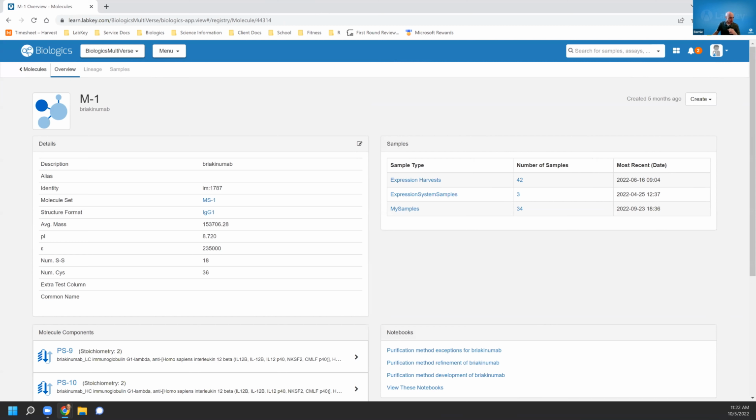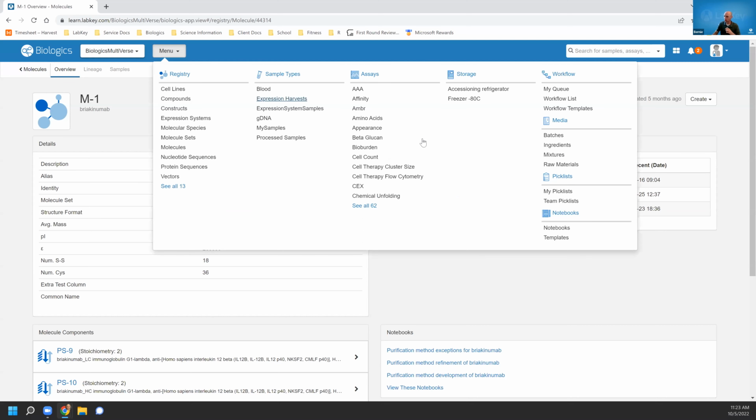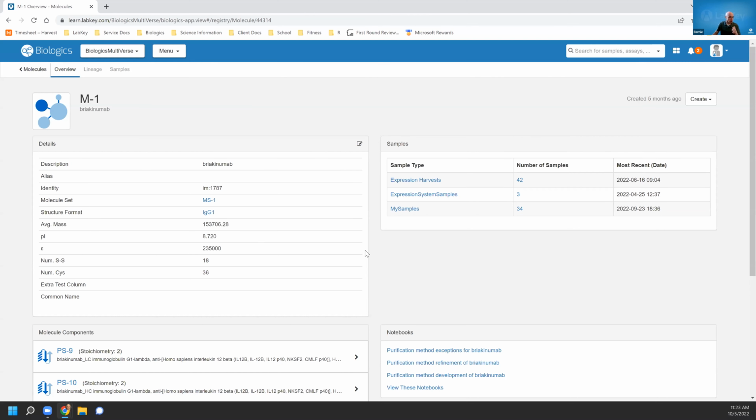So then there is ELN. So as a most often daily, but at least weekly operation, you are not going to be able to dodge doing your documentation. But especially with respect to time, you are going to be able to dodge me dragging you through composing a full notebook from scratch. I think that instead, what I should do is show you a little bit more about our ELN from the perspective of amending a notebook and maybe creating one from a template.